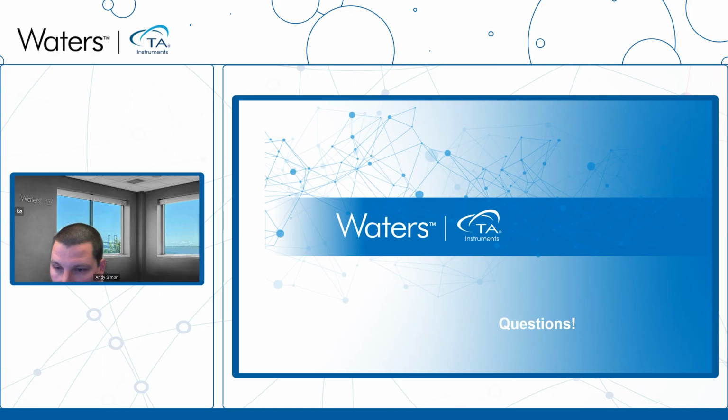So the next one: how do we compare the knit line strength of injection molded components with the knit line strength data from this experiment? And also, how do we benchmark the polymeric material sensitivity based on knit line strength? Maybe start with the first part: how do we compare the knit line strength of a component compared to the dog bone dual gate that we used in this experiment?